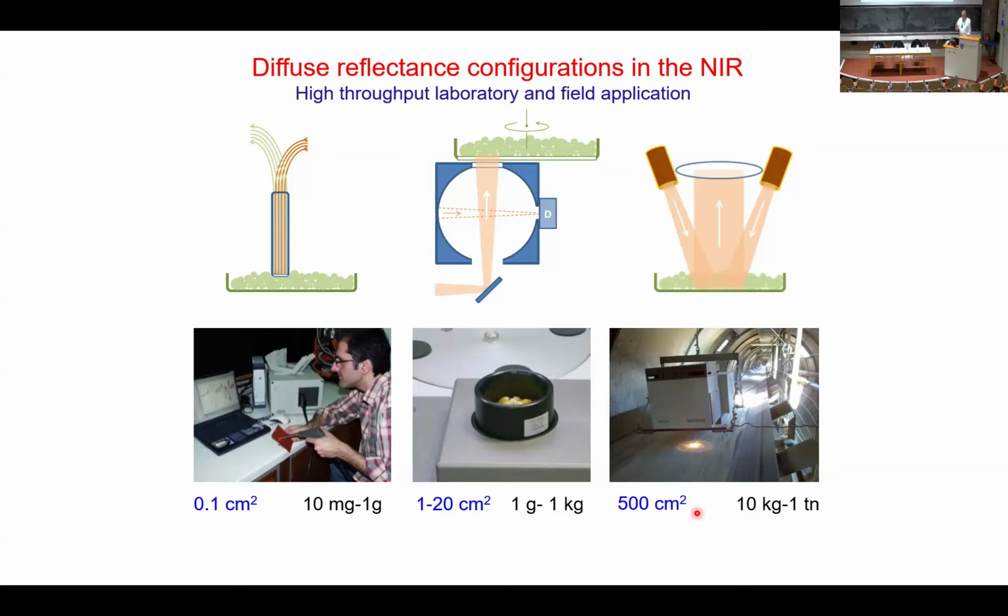We get more information if we let it dry in the air and measure it at roughly 15 to 20%, or whatever. But that's about it. We can see it in the presence of water. All right. Now, near-infrared, ATR already, but near-infrared par excellence is a technique that would allow you to measure hundreds or thousands of samples. And in this manner, you would be able to appreciate the richness of clay in a deposit, for example.